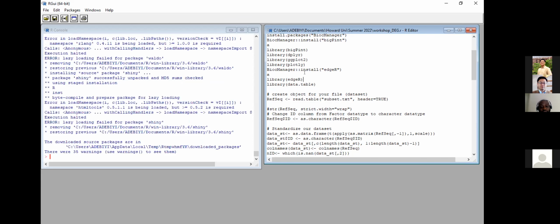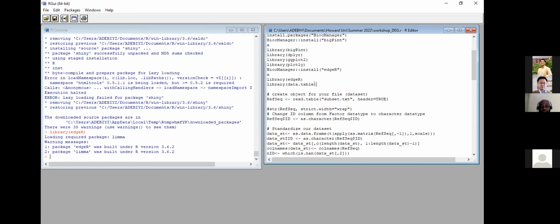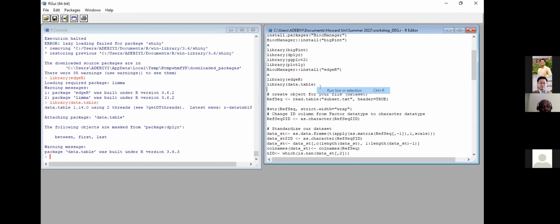Okay. Goodness. All right. So now let's library that, which is good. All right, so that's good as well. Okay, so that's good. So we have everything we need.